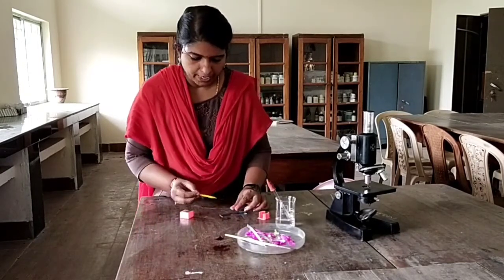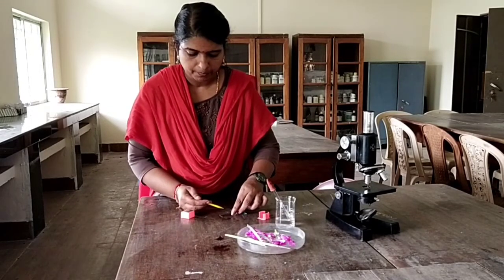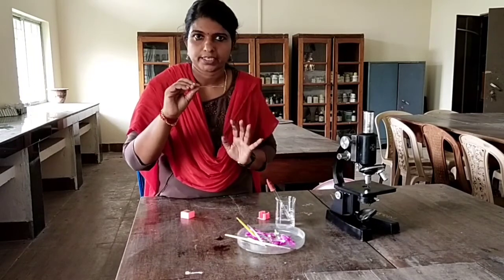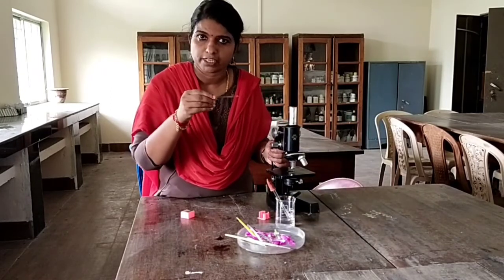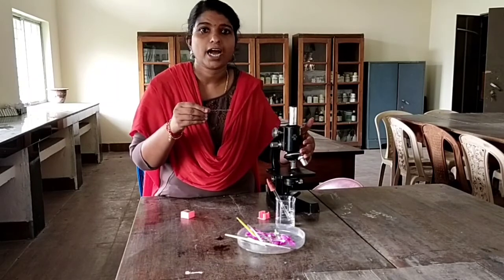Now we can place the coverslip. Next, observe it with the help of a microscope — first under low power, then under high power.